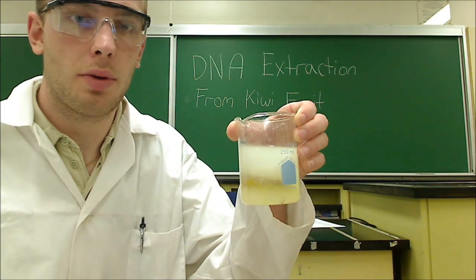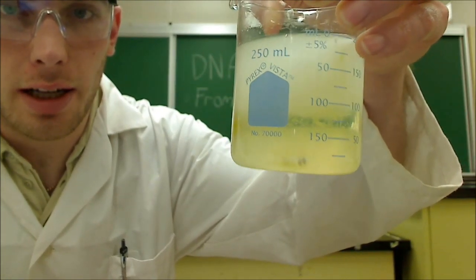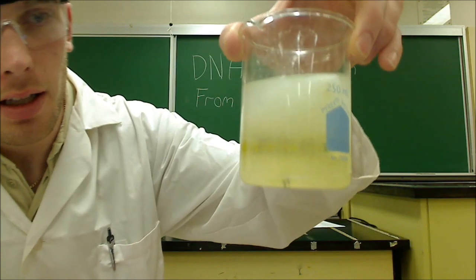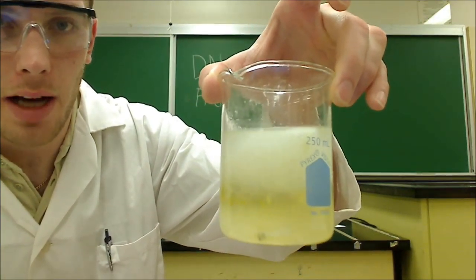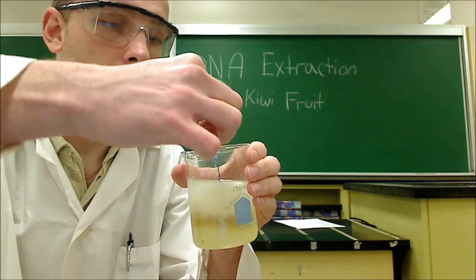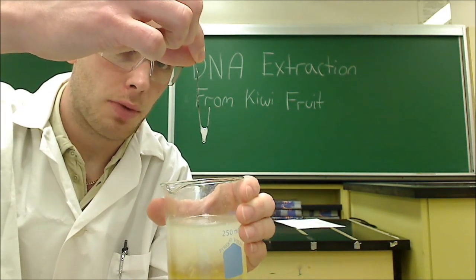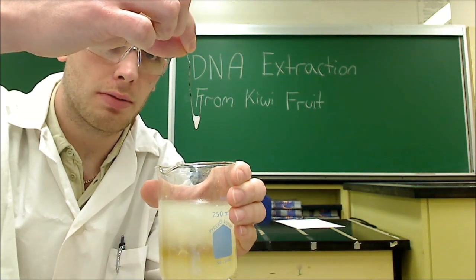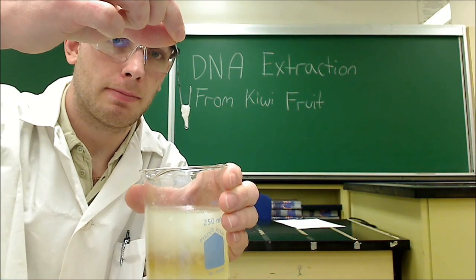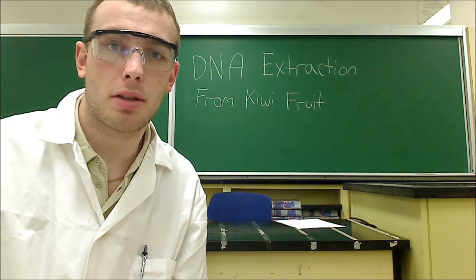I've given the kiwi mixture and alcohol a bit of time to settle and you can see it's formed two distinct layers — the top layer being a more white opaque layer and the bottom layer being clearer and a bit more green. What's making that top layer of alcohol cloudy is the fact that it's full of our DNA. Using a paper clip we can reach in and carefully scoop out our DNA — what I've got hanging on the end of this hook is my kiwi fruit DNA. A lot of students have a hard time envisioning what DNA might look like, so this is a great experiment to show them. I hope you have enjoyed this lab. Thanks a lot, bye.